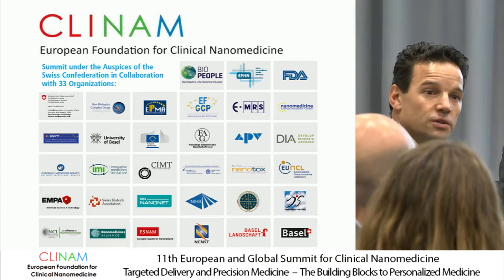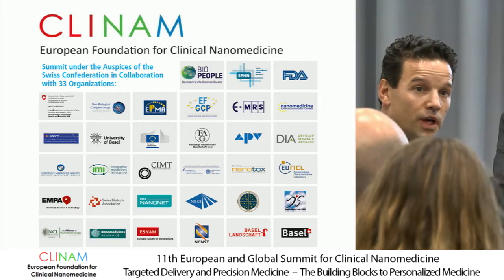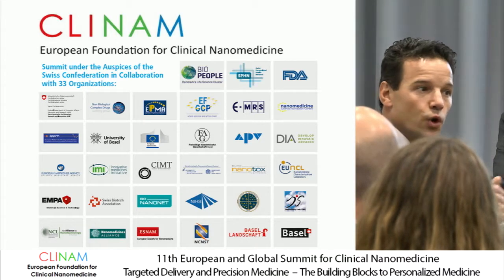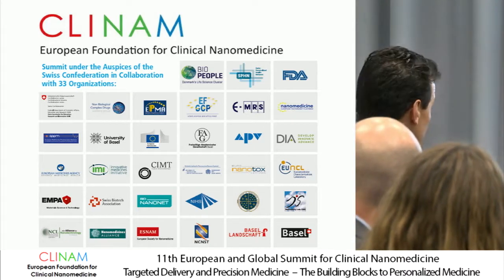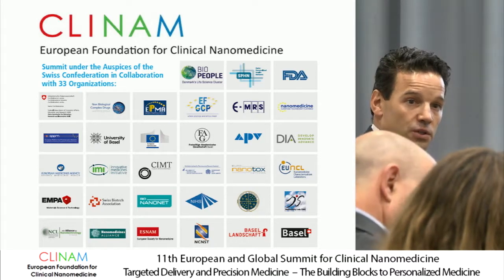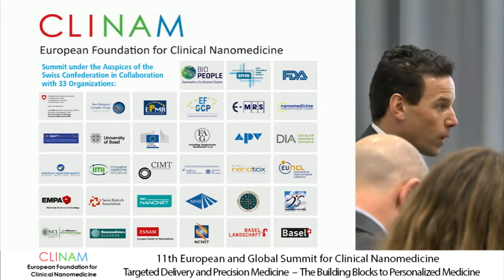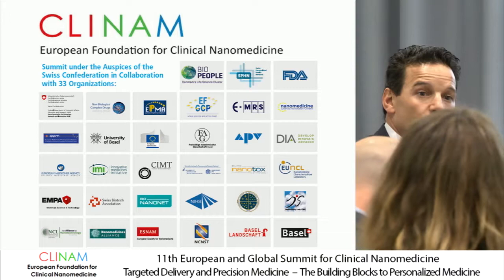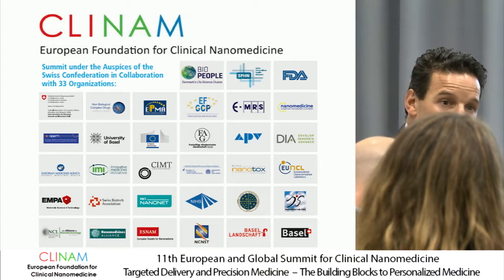Malvern has launched a new system called Archimedes. We worked on buoyancies. So if you measure liposomes and the carrier and the drug loading, that could be another system. So there is a panel and a spectrum of all this. Within the Nanomedicine Alliance, we dealt with it, and we invited people to give presentations to create a landscape. We hope this is going to be released in a form that is open access to everybody, because the consultation was open to everybody.